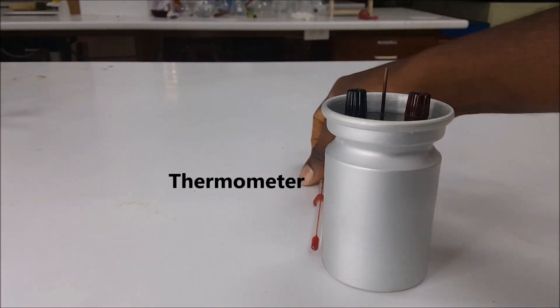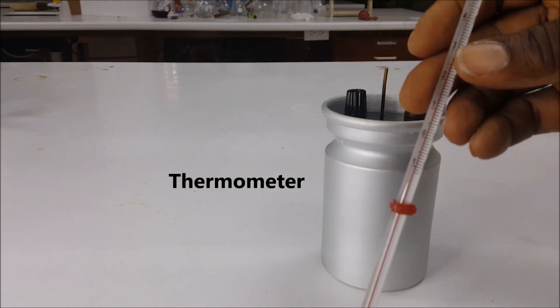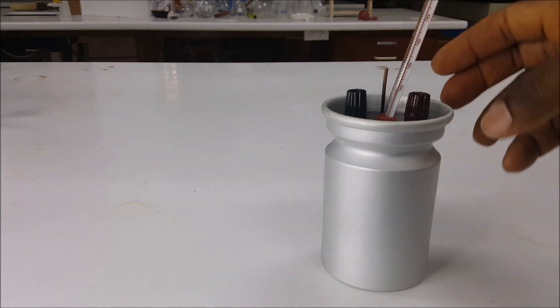Next, you will use a thermometer to measure the change in temperature as your calorimeter is functioning.